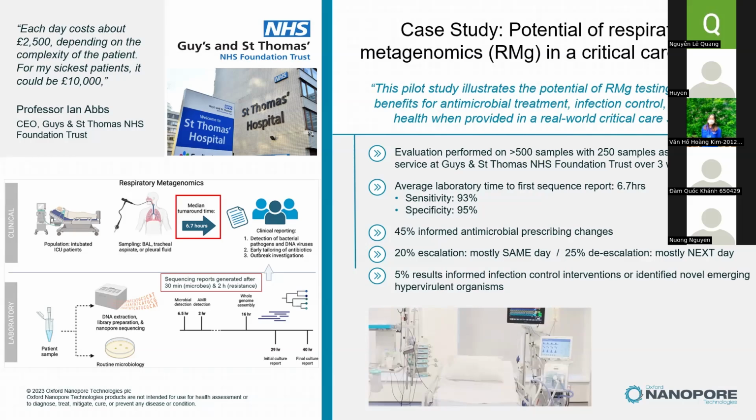And how about blood samples? Sorry? The blood one. Yes, blood is very common. It's very, very common. We do have that protocol on our website. Okay, thank you.